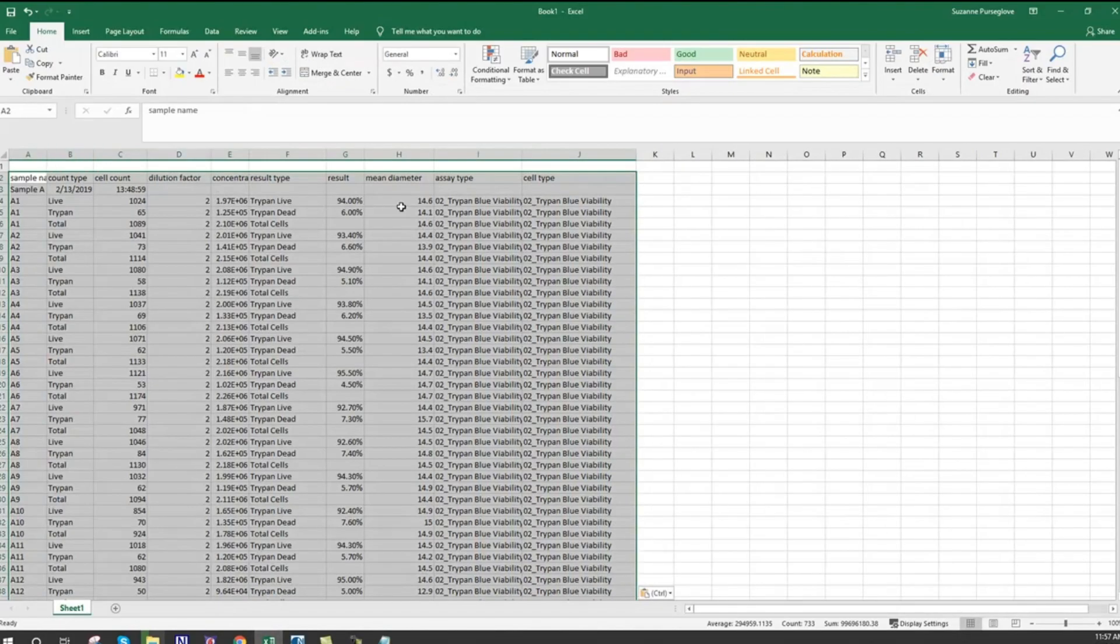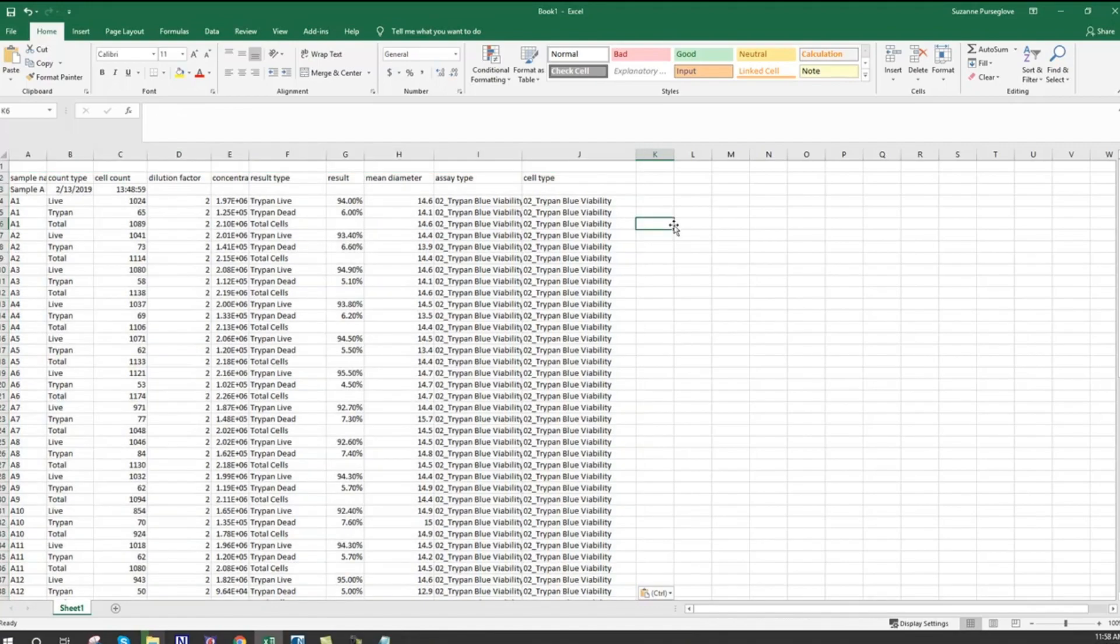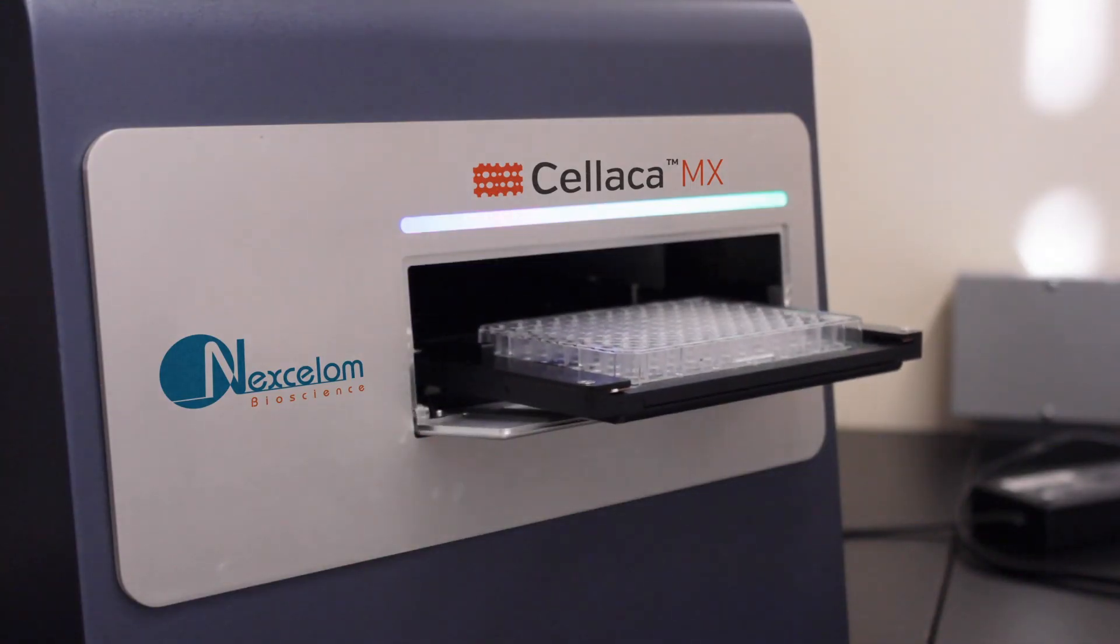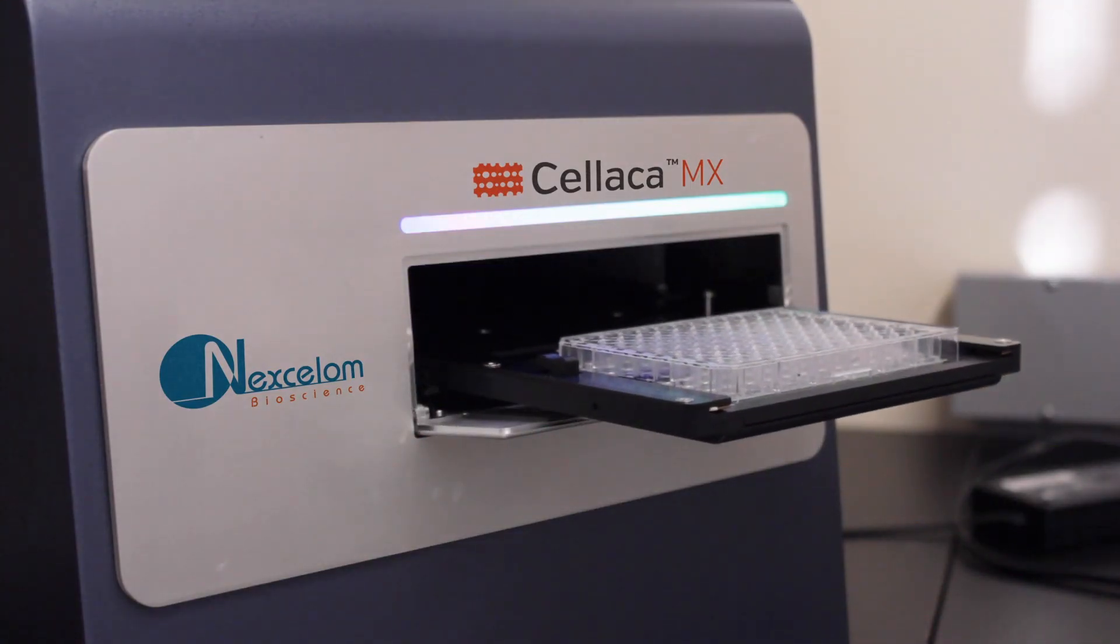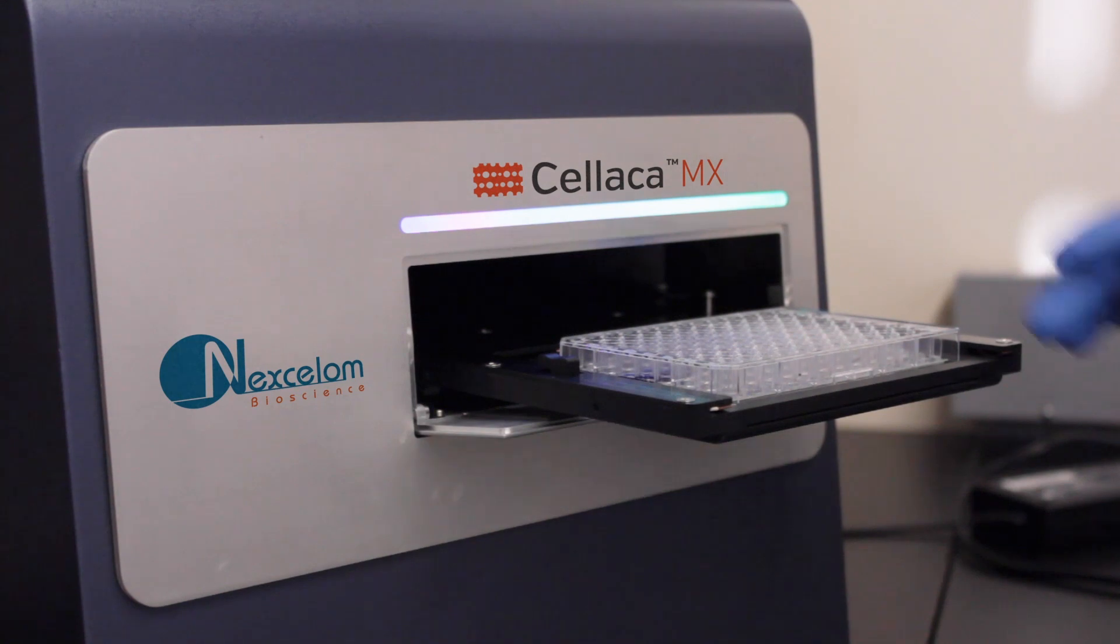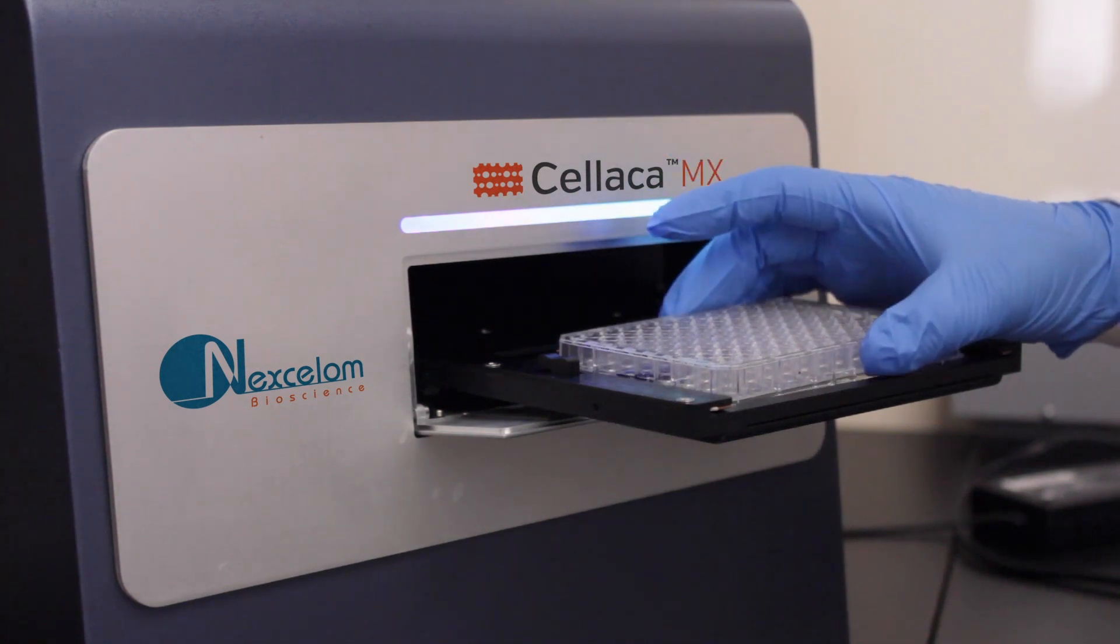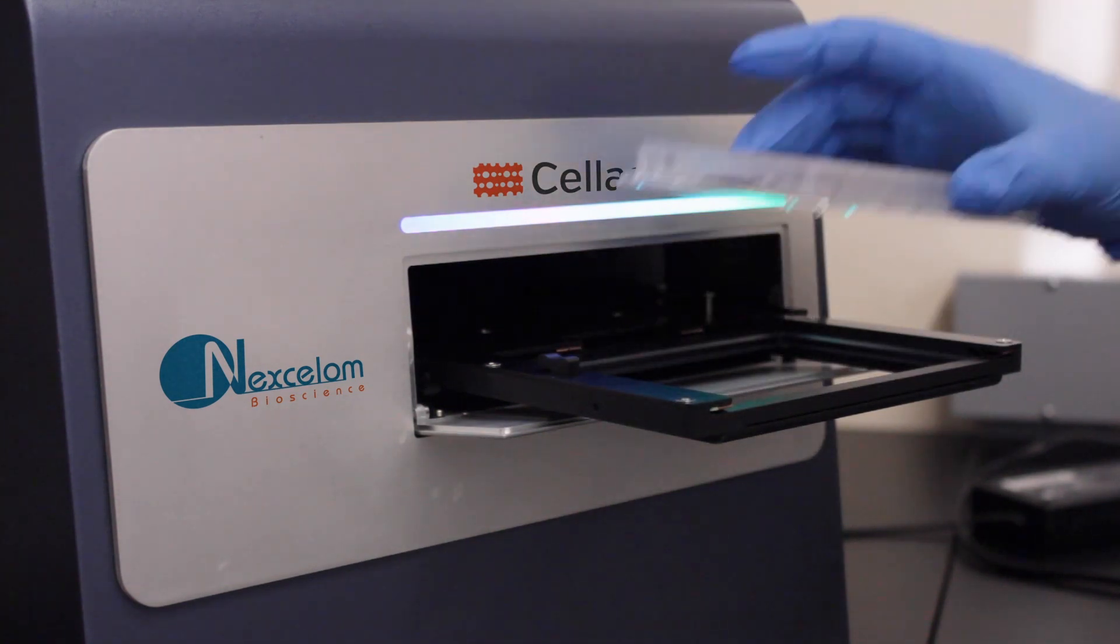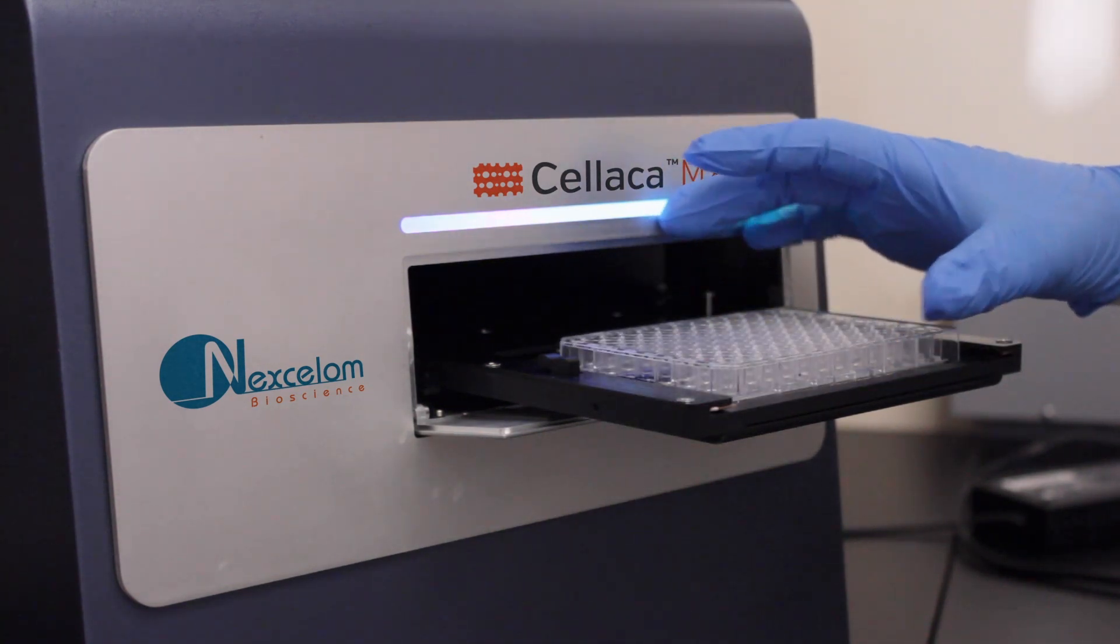The Cellaca MX is now ready to analyze the next batch of samples. Since no additional instrument setup is required, simply eject the current plate and load a new one.